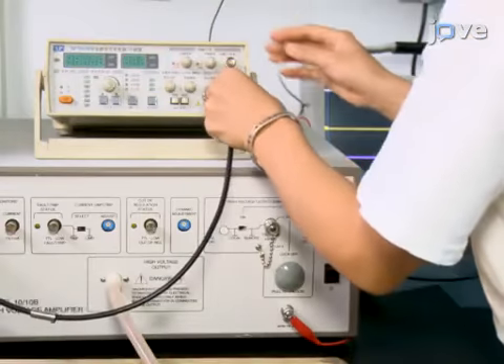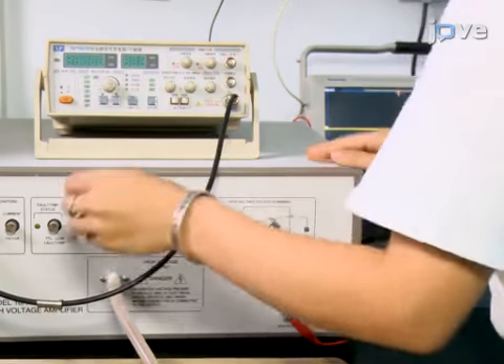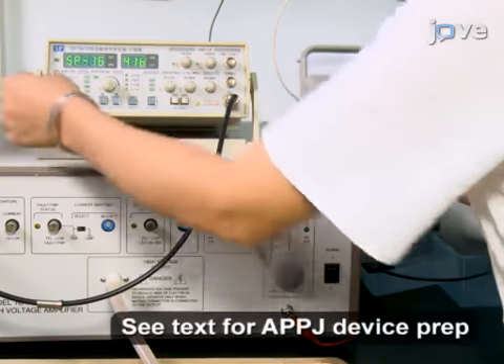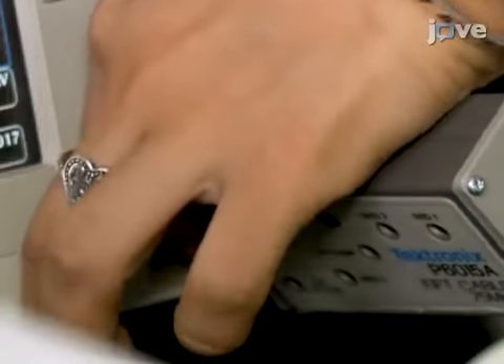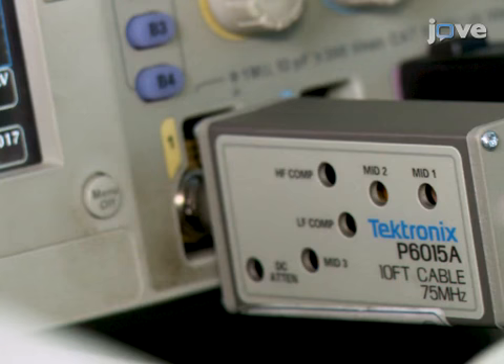First, connect a high-voltage power amplifier to a function signal generator that serves as a power supply to provide an AC signal. To record the waveforms of the applied voltage to the high-voltage electrode, connect one end of the high-voltage probe to a digital oscilloscope and connect the other end to the power supply.